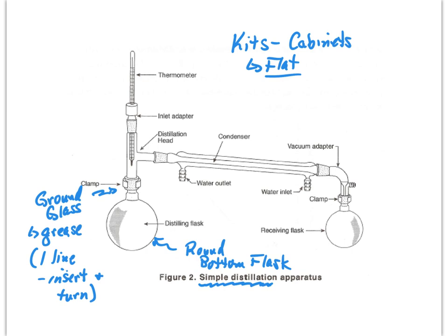So we put things together. There's a distillation head. There's an inlet adapter, which is a straight glass piece. Don't forget, there's a rubber thermometer adapter.